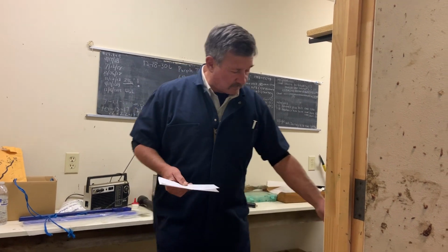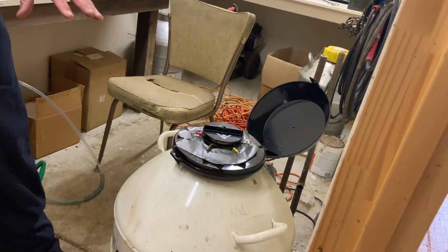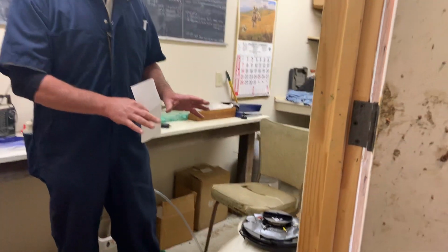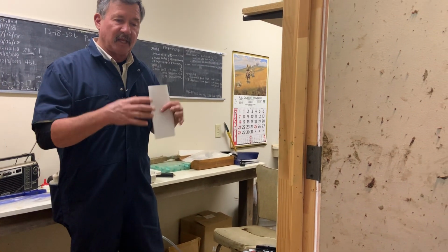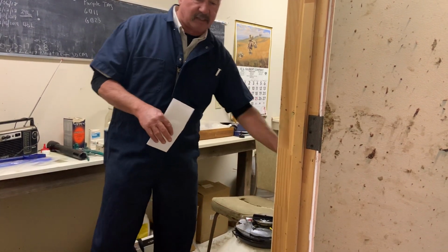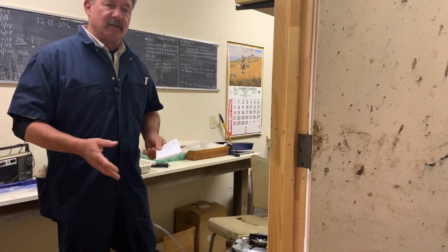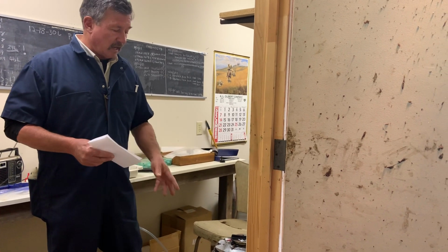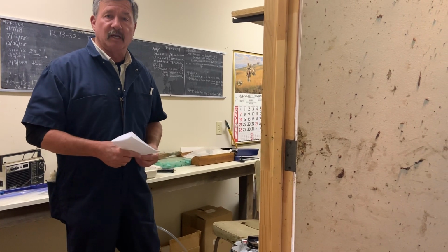So what we have here is a liquid nitrogen tank. This is basically like a big thermos, a double-walled thermos, so it keeps the nitrogen in a liquid phase. Nitrogen is always expanding, so there's always a little bit of it being vented out, and there is a vent on these tanks so that they essentially don't explode. Since the nitrogen is always evaporating a little bit at a time, we have to recharge these tanks. In other words, we have to pour more liquid nitrogen in there on a periodic basis.